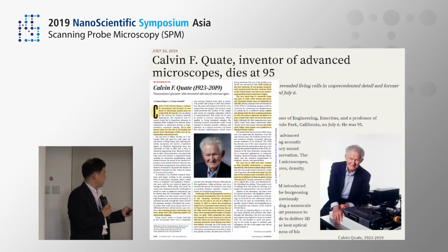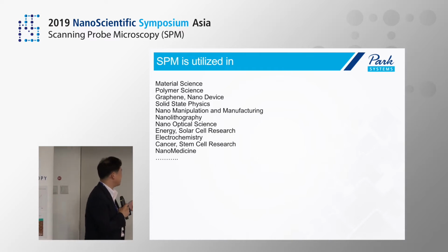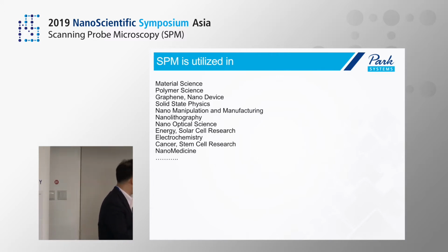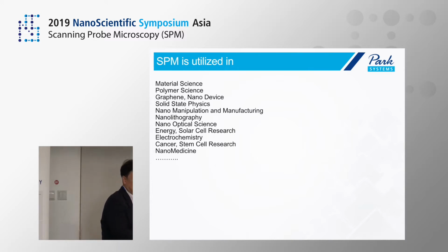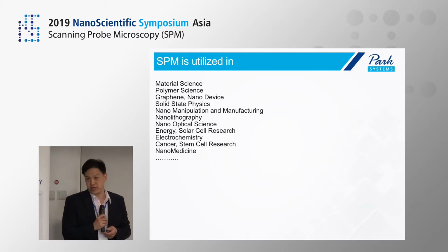Because of his contribution, there are many applications and areas actively using AFM, like material science, polymer science, graphene, solid-state physics, nanomanipulation and manufacturing, nanolithography, nano-optical science, energy and solar cell research, electrochemistry, also cancer and stem cell research, and nanomedicine. These topics were actually presented 2 weeks ago at the NanoScientific Europe symposium. So it's covering a lot of territory right now.